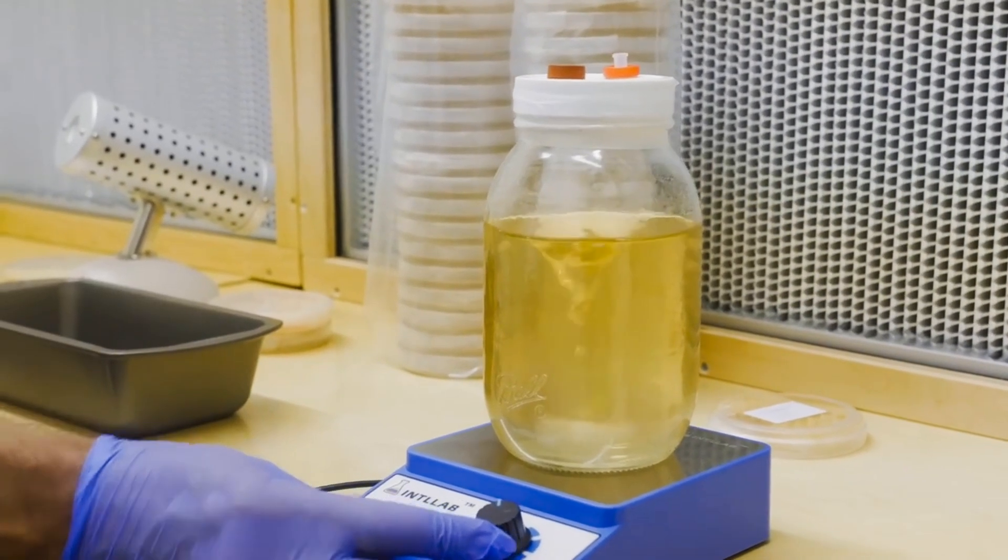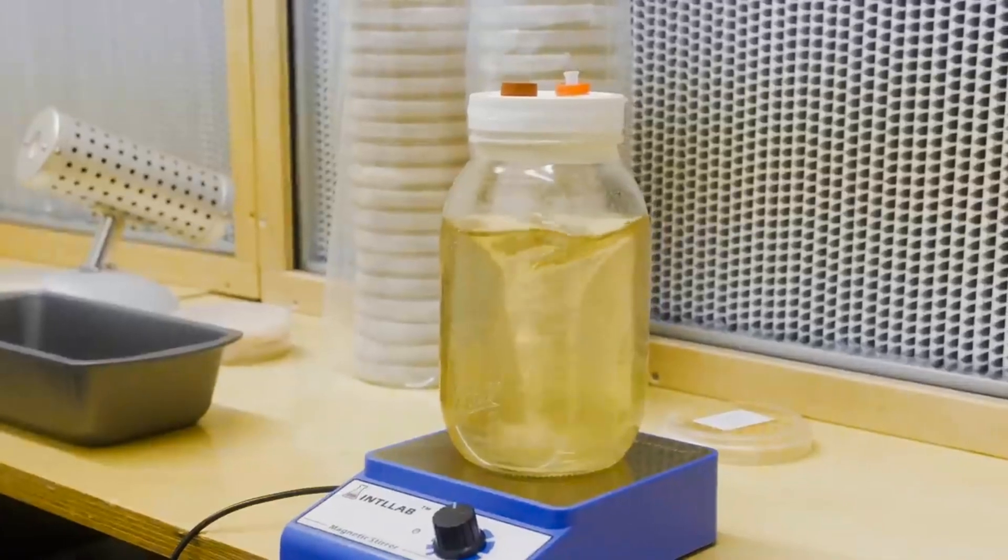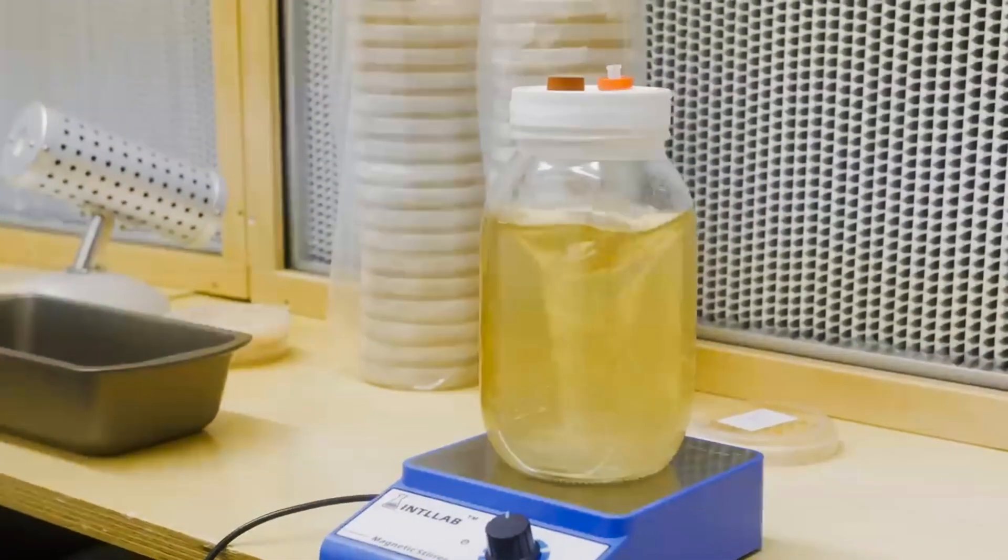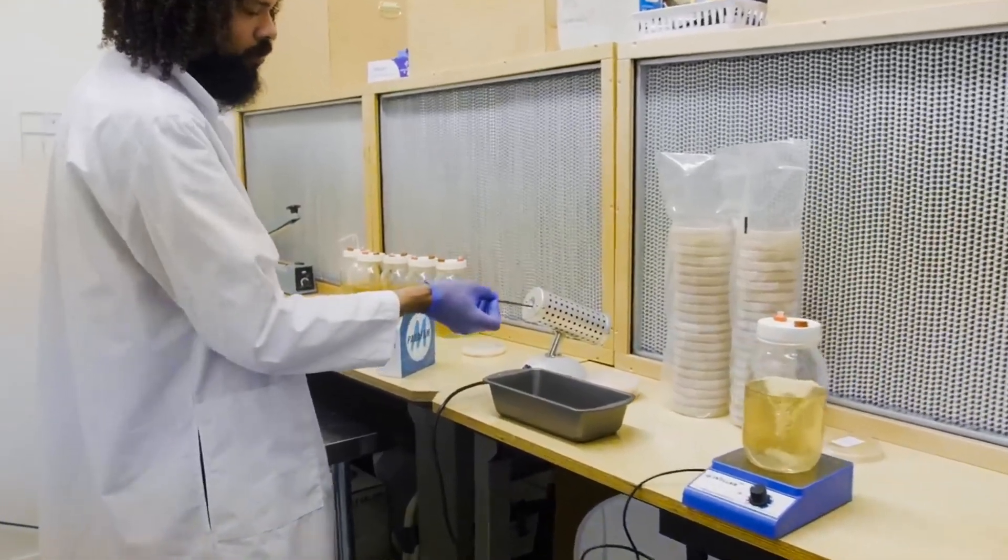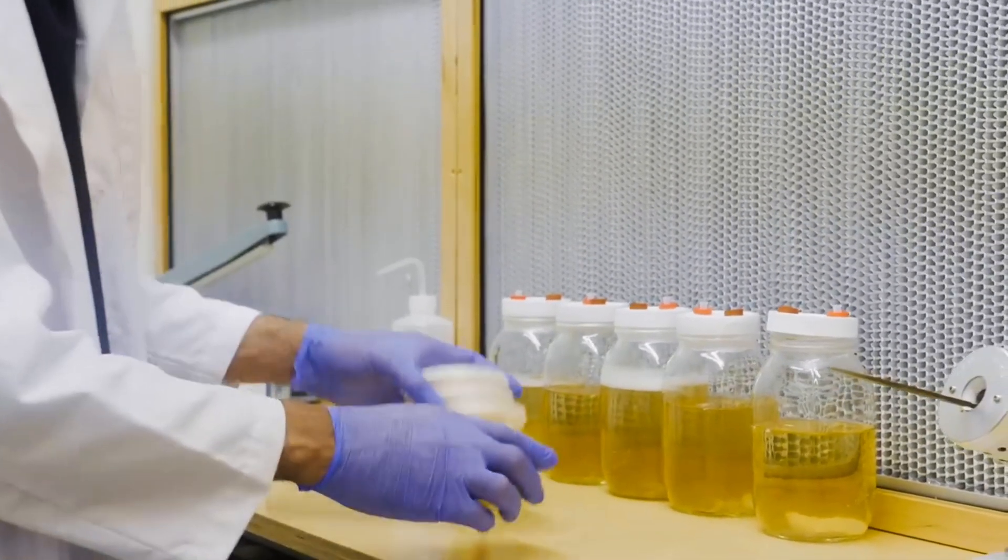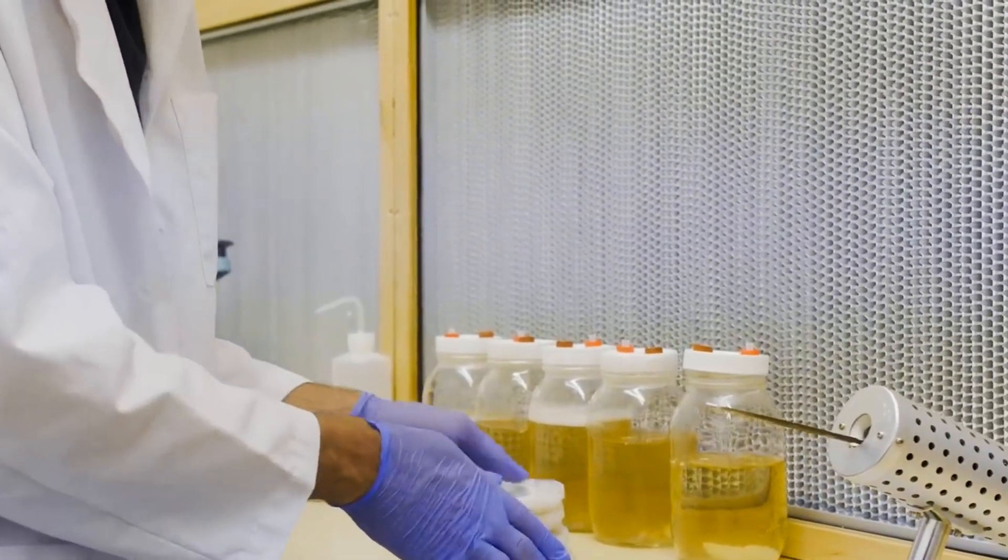Do everything in a still air box or really use strict standards in a clean working space that doesn't have carpet. I'll re-sterilize my tool. If you ever lose the culture or something, try to do some more work on it.